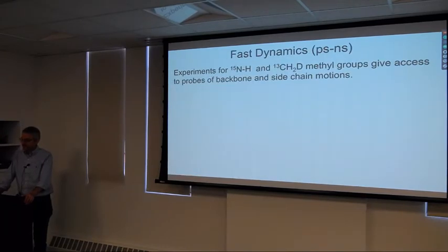Okay, so first we'll talk about the so-called fast time scale dynamics. The best developed sets of experiments are for the backbone NHs and for deuterium in carbon-13 CH2D isotopomers. That said, there's now ever increasing numbers of experiments that have been developed, so you can go to the literature and find many more experiments. I'll just talk about these two as kind of prototypes of the whole field.